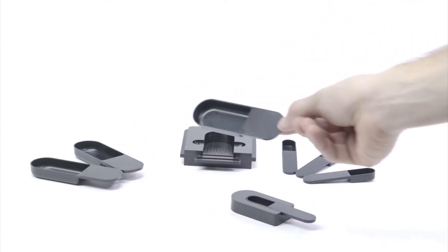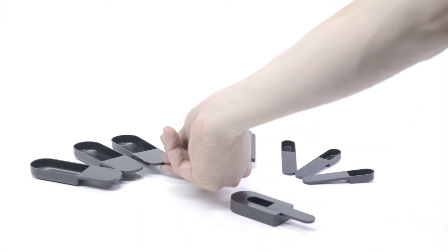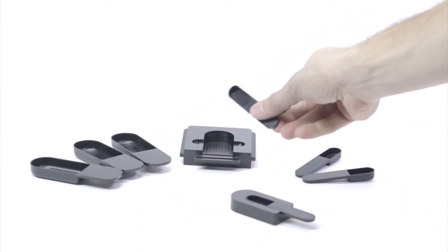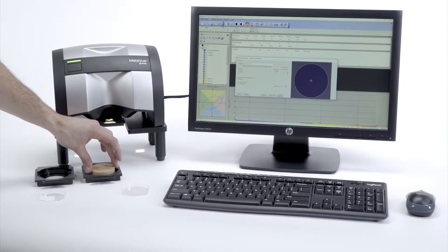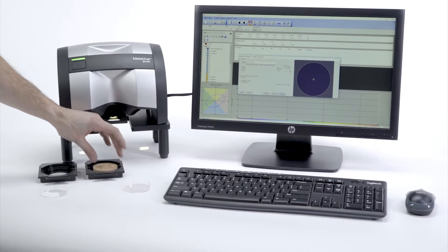Two sizes of spoons are available, so you can select the one that best fits your application. In addition, if you employ petri dishes in your process, you can place them into one of the sample holders for measurement.